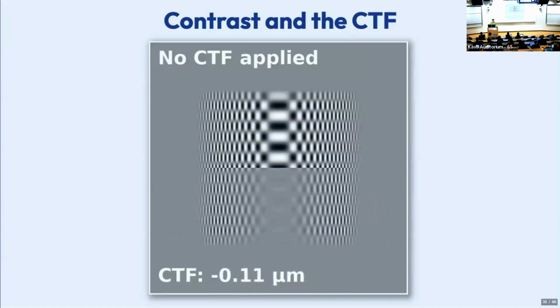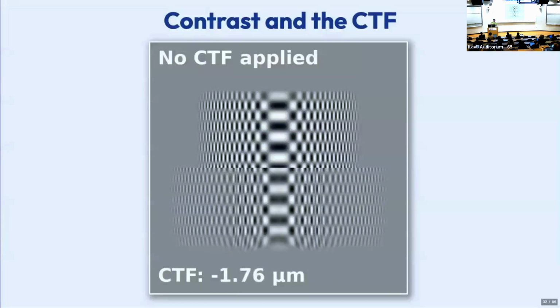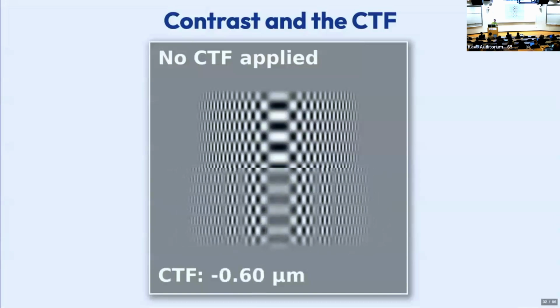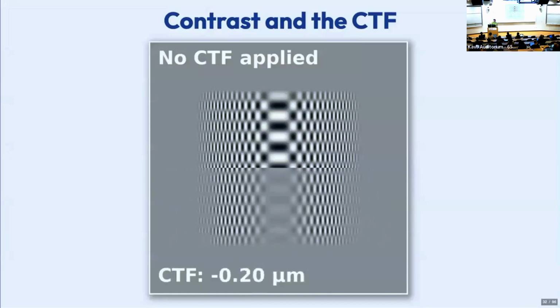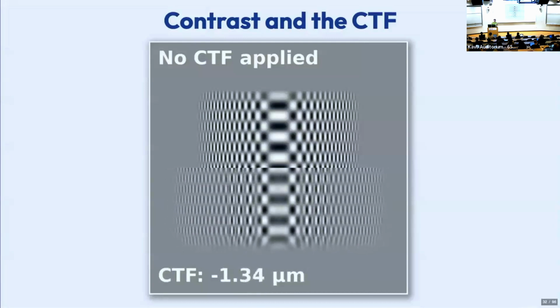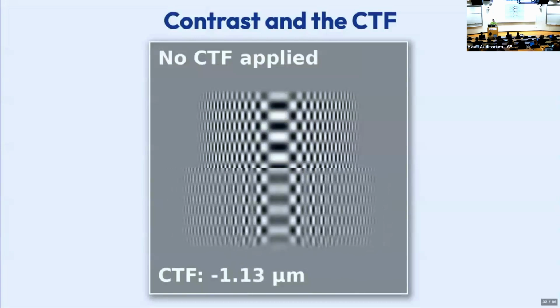for this movie, for this exact sort of particle, well, I guess for these movies really, how we fine tune that, right? How much more should we trust the early frames? And sometimes, as Wah just said, the first frame is actually bad, actually very bad, because it's moving too much. And so our sort of intuition about the first frame should be the best and the last frame should be the worst is sometimes a little bit off. And so there are jobs that can help you in that area too. Yeah.